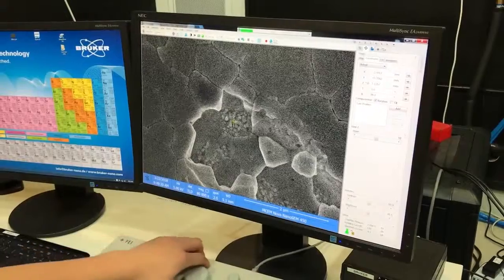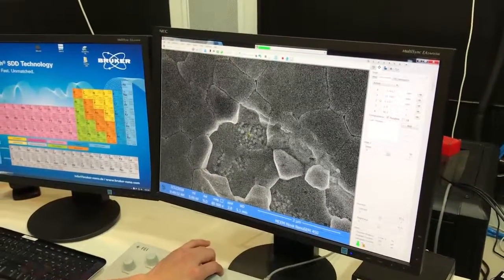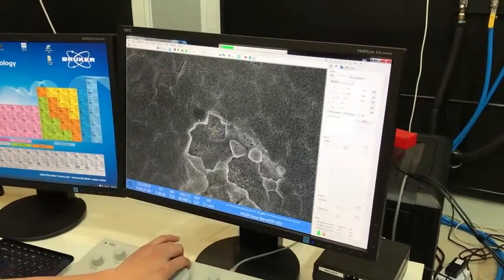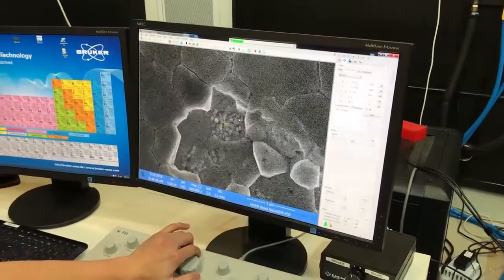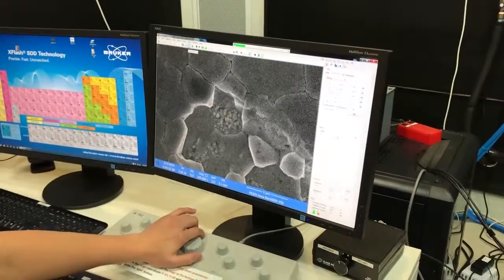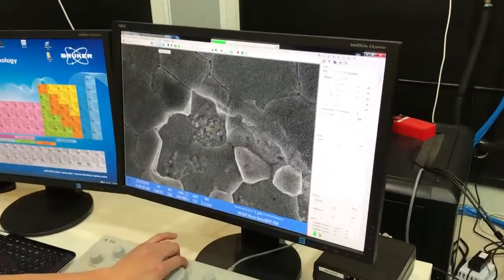So before we take the image, we need to... Beautiful specimen. Look at the texture of it. It's coming out beautifully on the iPhone. Actually, I'm filming with an iPhone, which some film directors actually use to film entire feature-length films. So, yeah, you're not getting shortchanged here.